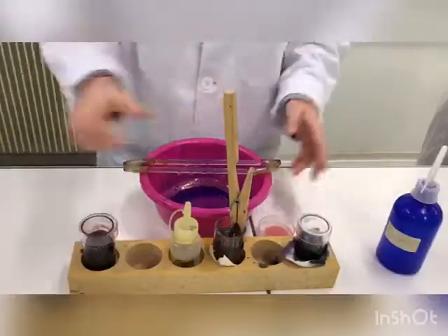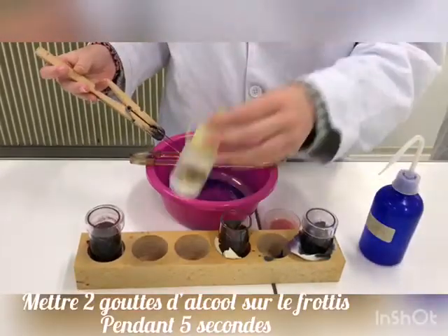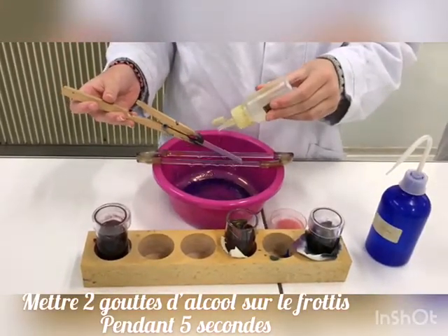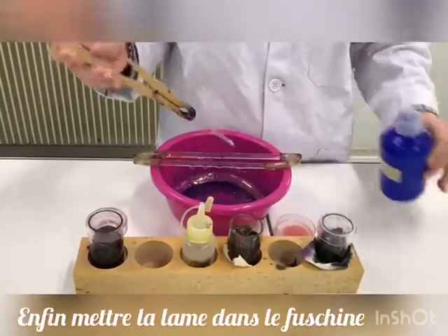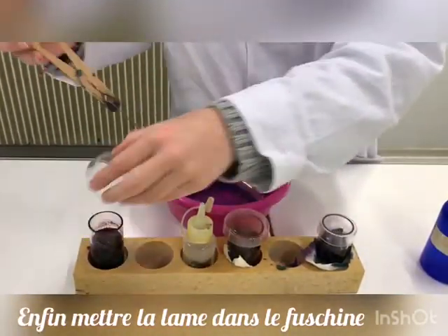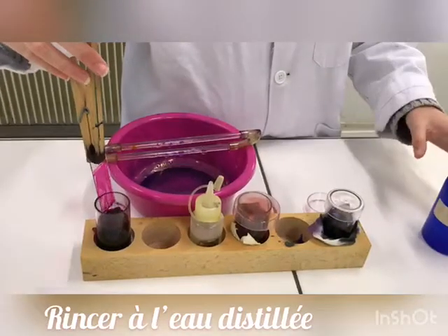We rinse with distilled water, put a few drops of alcohol for five seconds, and rinse again with distilled water. Finally, we put the slide in the second dye, which is fuchsin, for one minute, then rinse with distilled water.